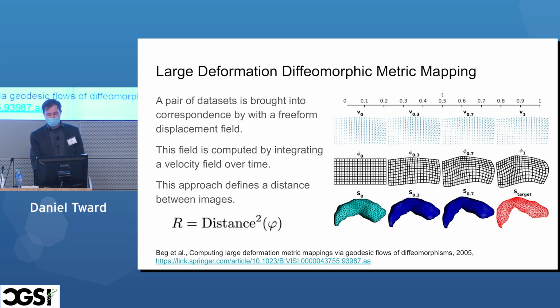When we have these displacement fields that you see in the second last row, the displacement fields can act on our imaging data to deform them, and we'll compare how similar this deformed blue surface is to this red surface, and conduct an optimization procedure in order to make them as similar as possible within limits that we are preserving some sort of regularity.